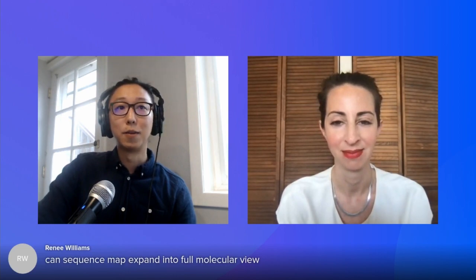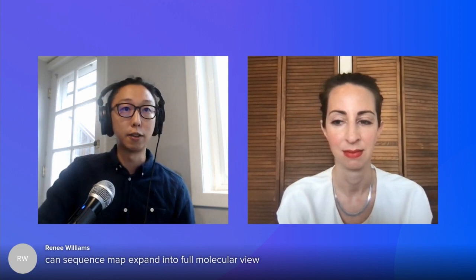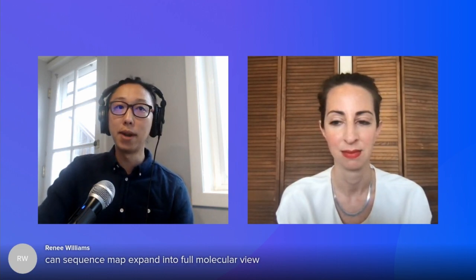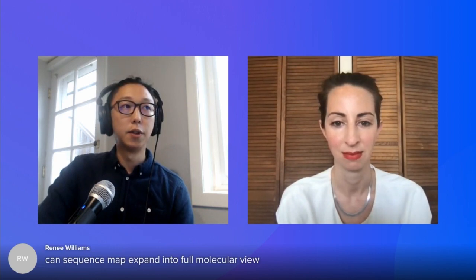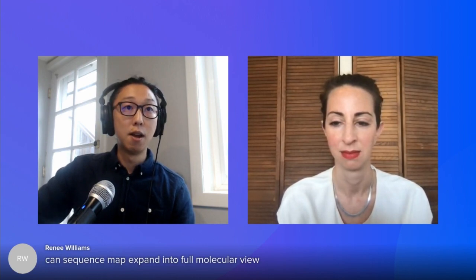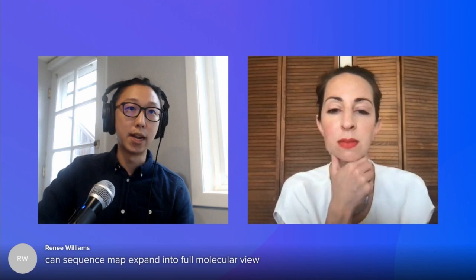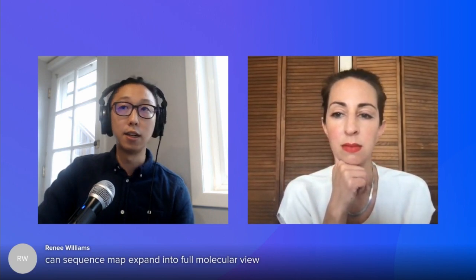Renee asks, can sequence map expand into full molecular view? Yeah, that's a good one as well. So we are tracking now the chemical structure of each of the monomers used in a nucleotide. And so that full atomic or full molecular structure view is another downstream roadmap item for us. The real goal here is to use Helm and the structured way of breaking up sequence entities into chemical structures as a way to help translate entities that could either be represented fully as a sequence string or fully as a chemical structure. And so in this case, being able to actually render and combine all of the chemical structure of those monomers together in an intuitive way.